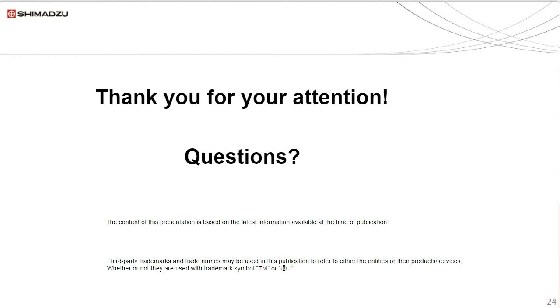Okay. So the next question we have is, taking into account the complexity of some matrices in different drugs, which internal standards do you recommend? The customer has issues with scandium as an internal standard.